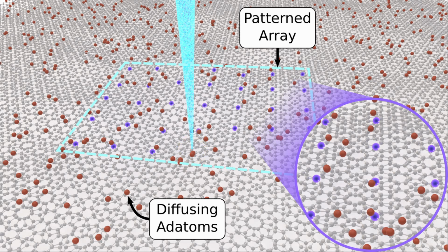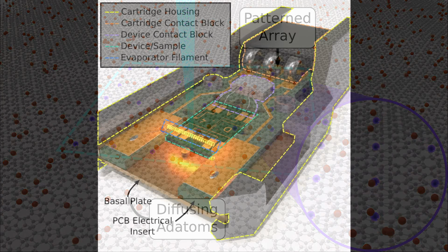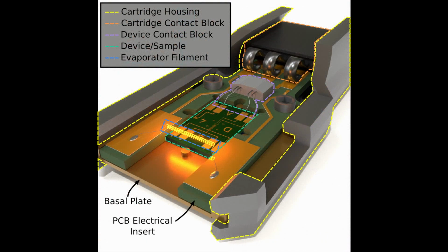supply source atoms to a sample without redesigning the whole microscope? We present two possibilities that represent concrete examples of a simple way this could be done with existing hardware. In the first example, we start with the commercially available neon electrical cartridge.